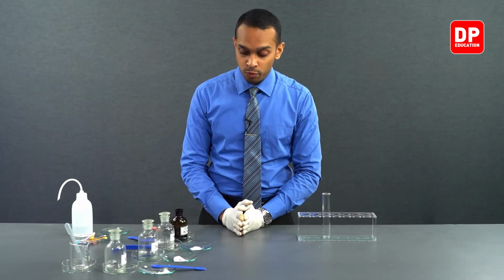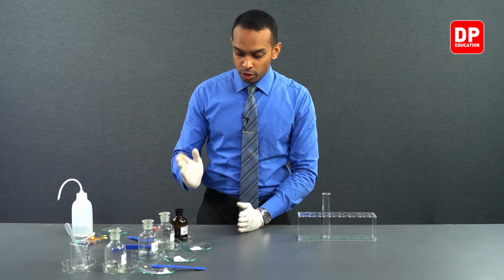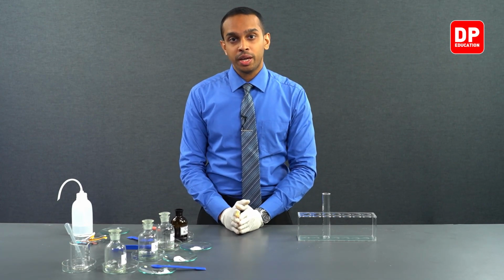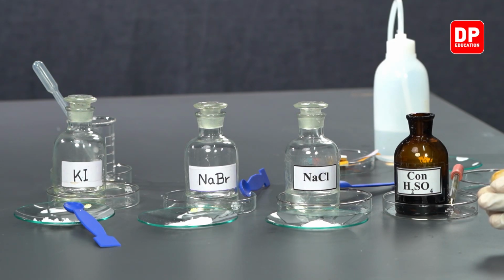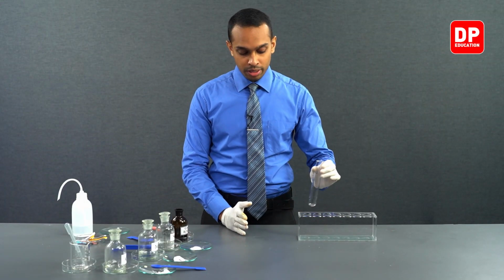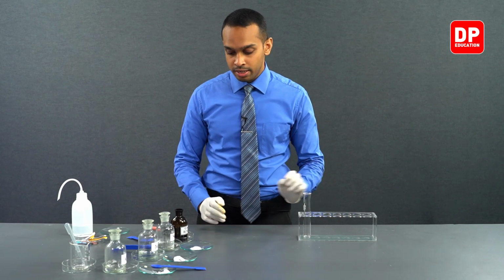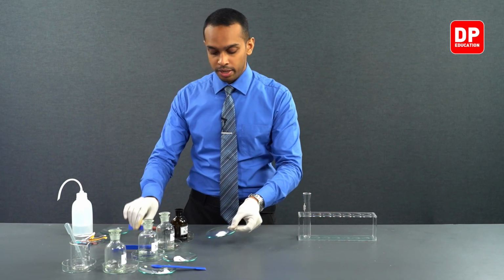Finally, let's move on to sodium chloride. Concentrated sulfuric acid is a good oxidizing agent. Let's see what it does to sodium chloride. So let's take a boiling tube and add a little bit of sodium chloride onto that.